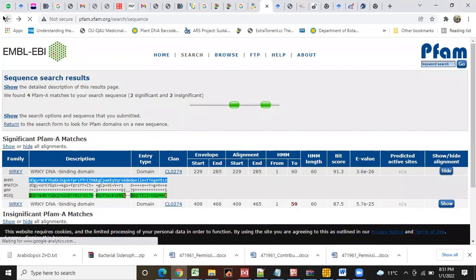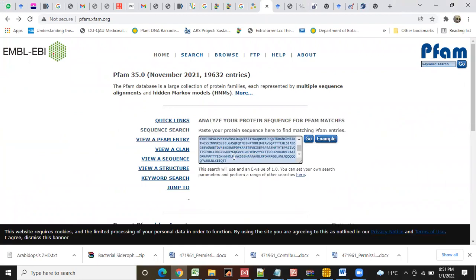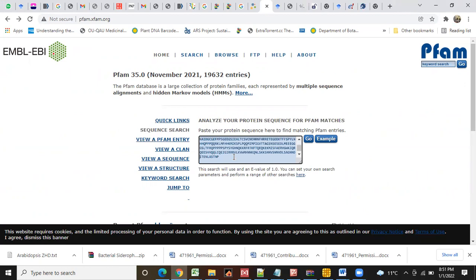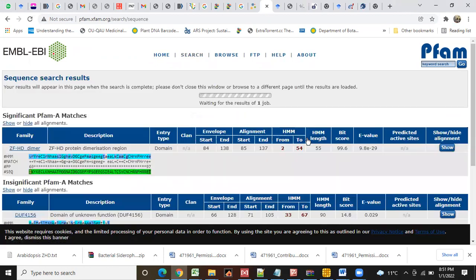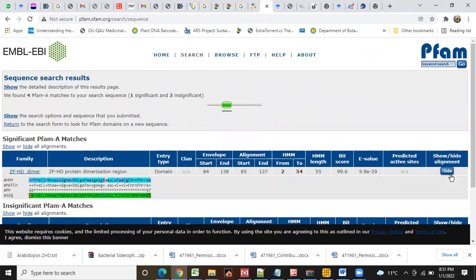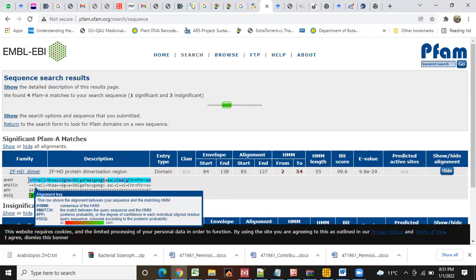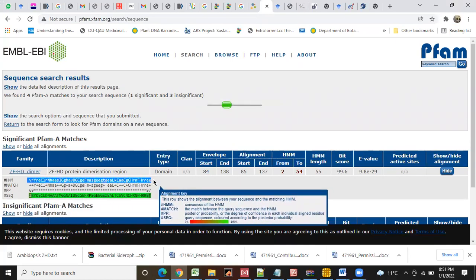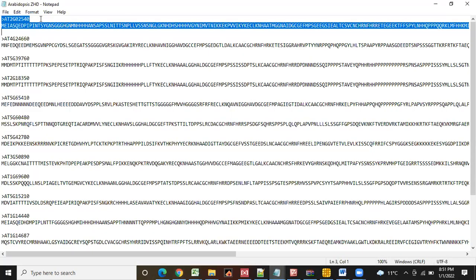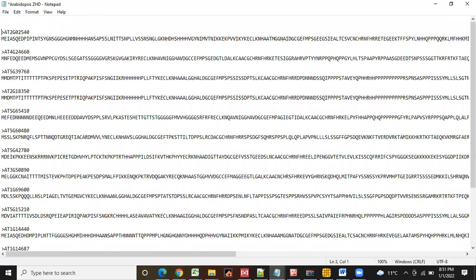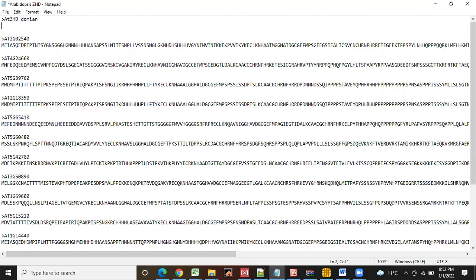You have an idea about PFAM? We will search out a sequence here, only the sequence paste here, then we will find where is that ZFHD domain, and we will copy that specific domain. Then we will save ZFHD domain.